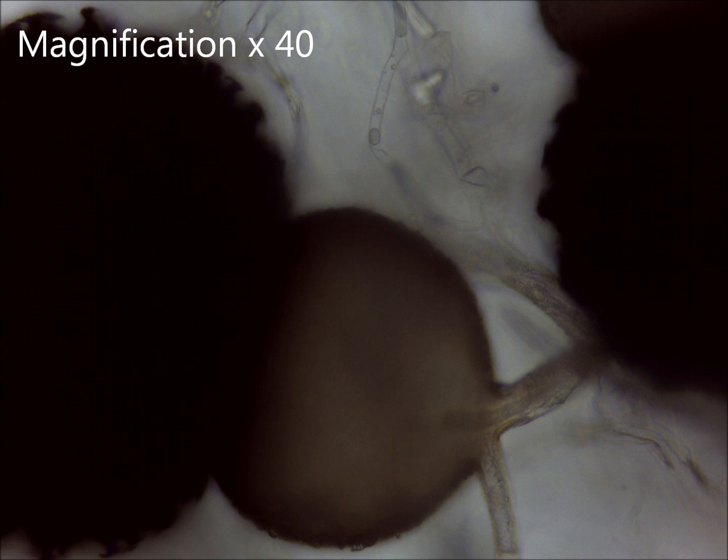Now you can increase the magnification to times 40. Again, remember to adjust the lighting.